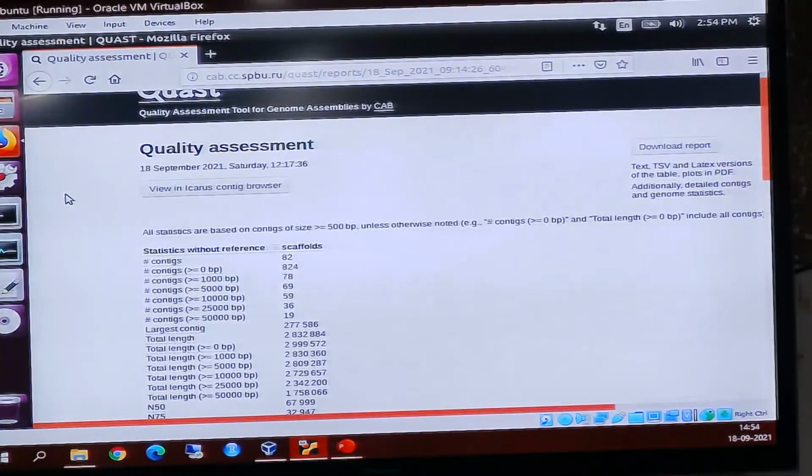In the genome case, you are not going to get only one file with the complete sequence of your whole genome. Instead, you are going to get a multiple number of contigs, but the lower the number, the better for the assembly and for the analysis you are doing with your data.